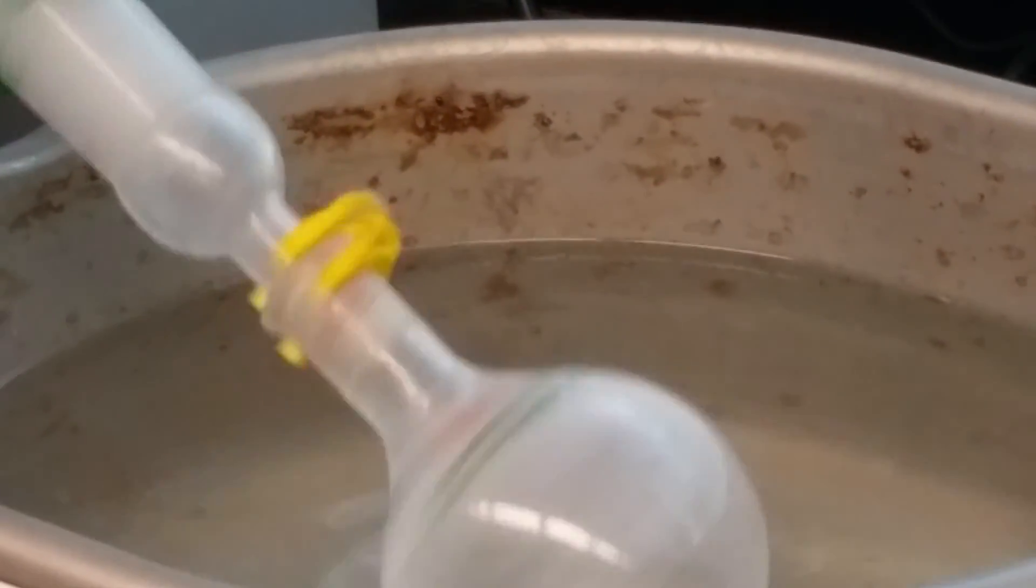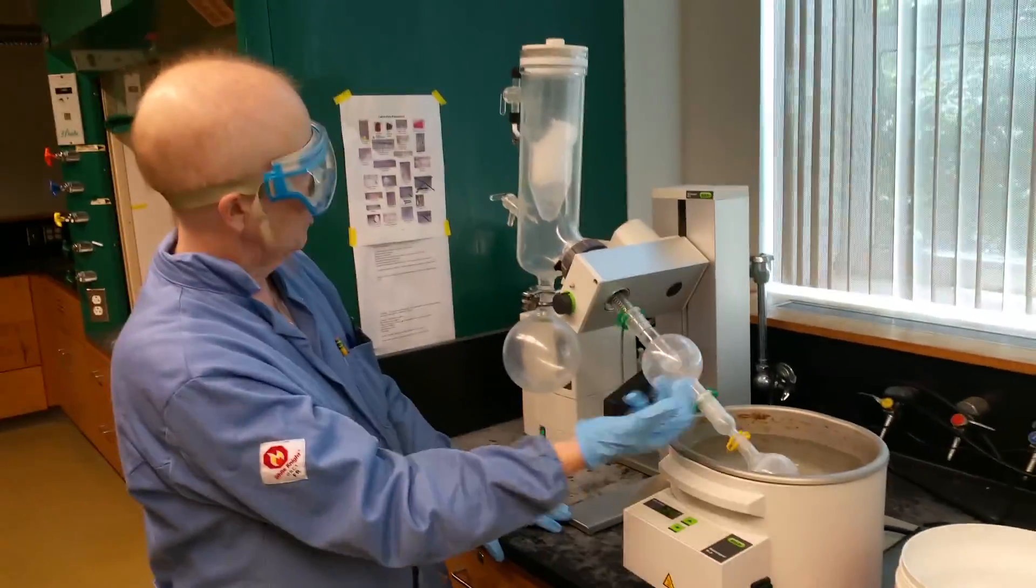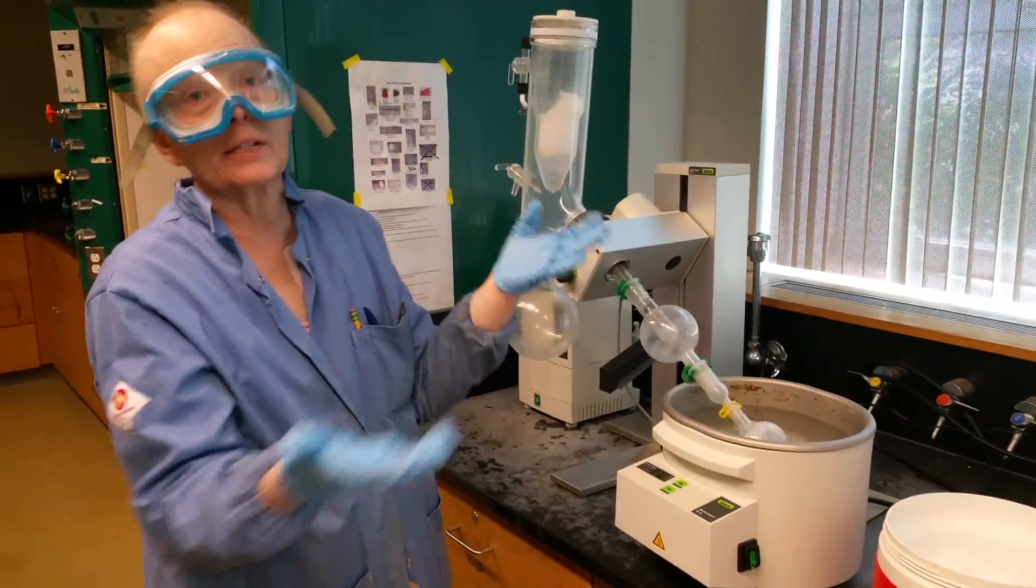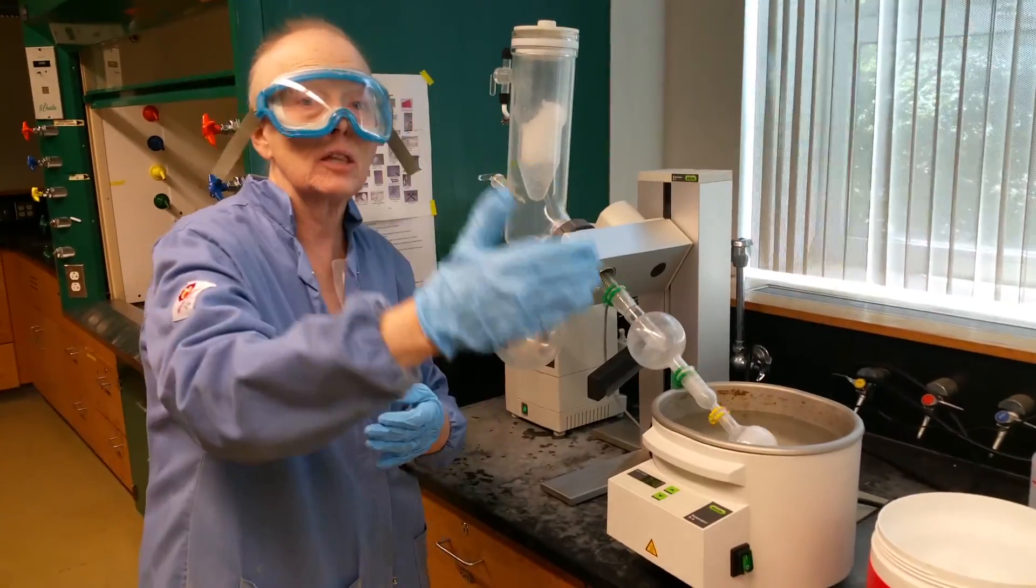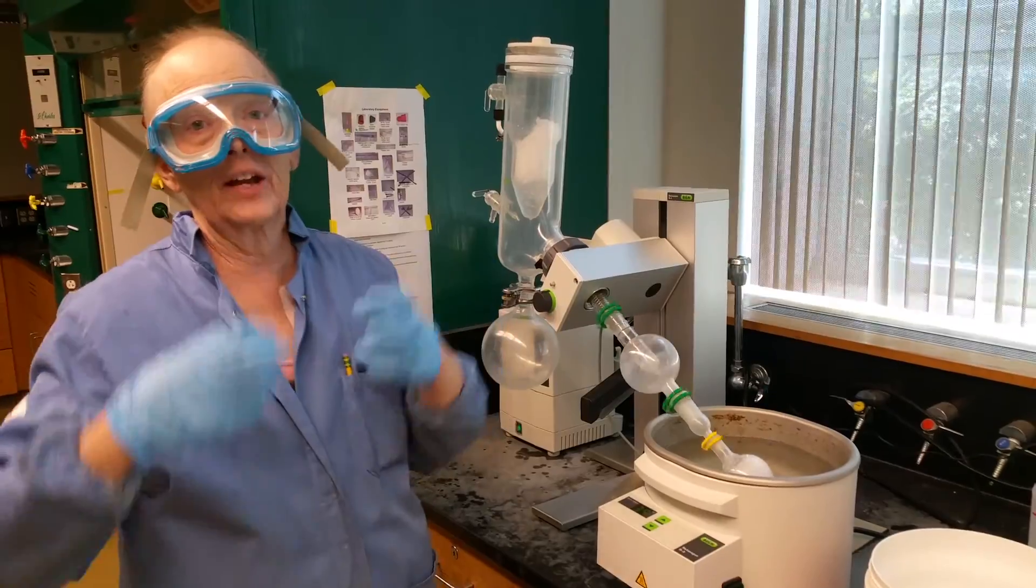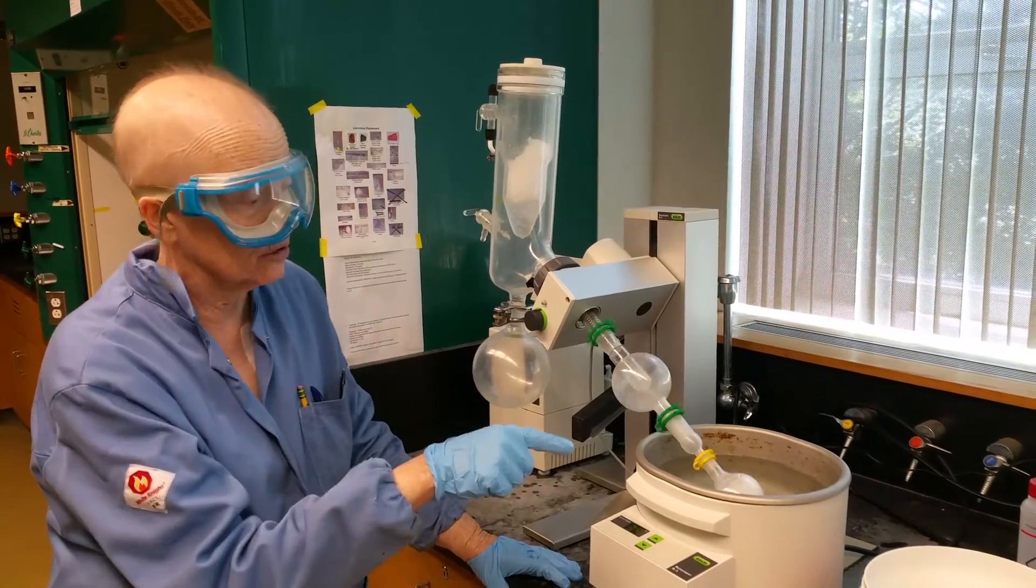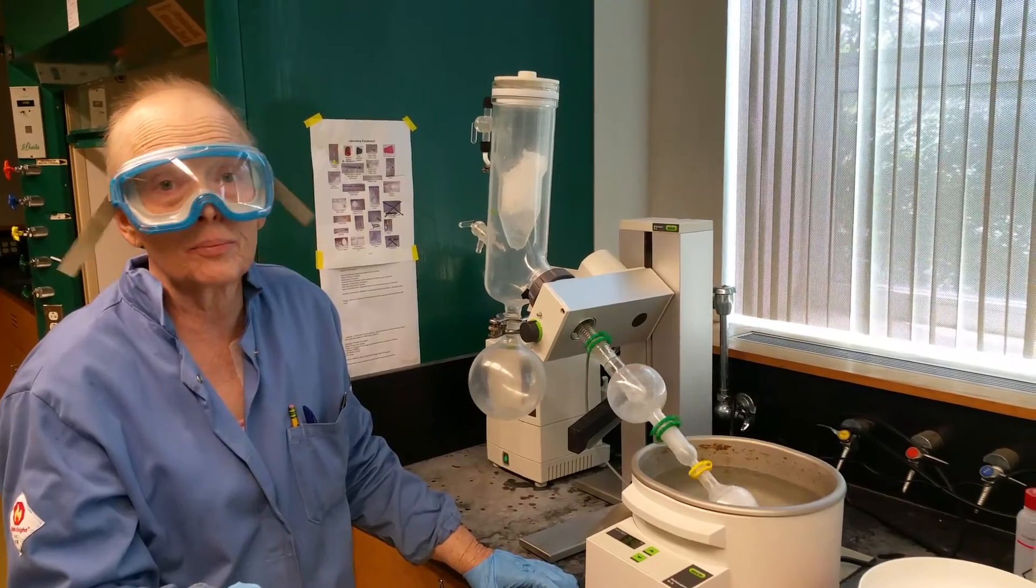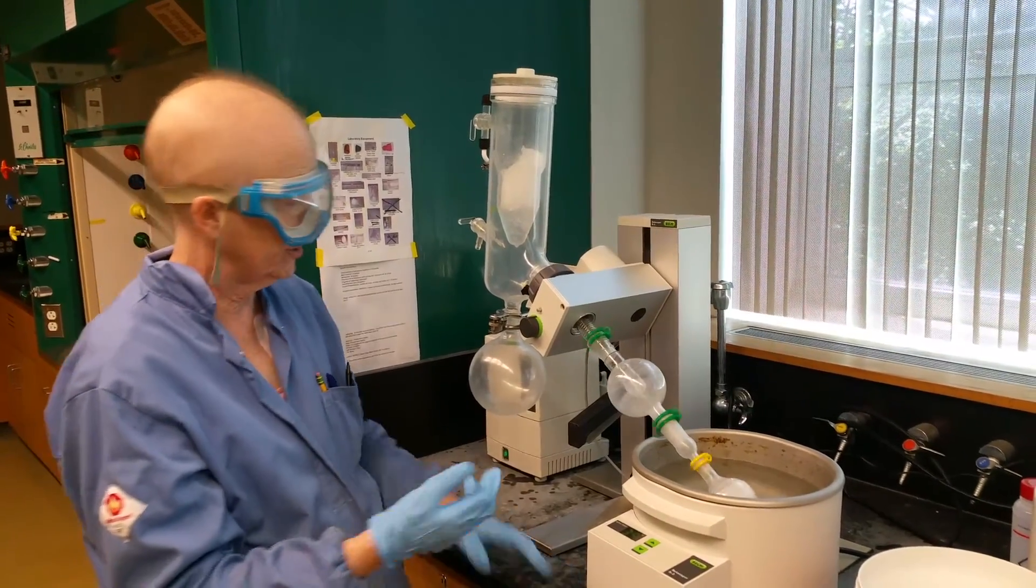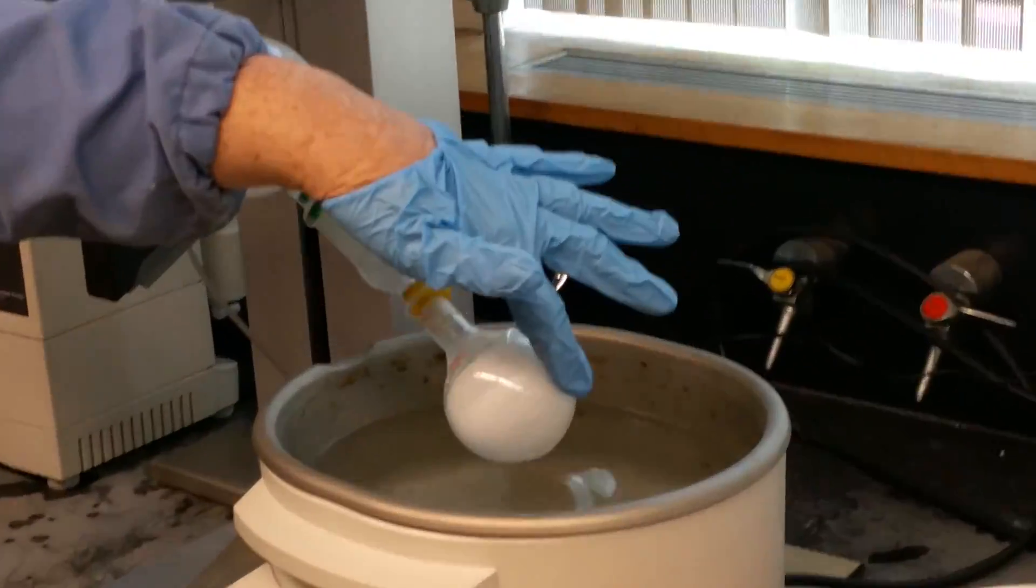All the vapor is leaving. The solid is staying behind. This would not work for two liquids that had close boiling points. If you had two liquids like cyclohexane and toluene, they would both vaporize and distill over. And notice you have no thermometer to keep track of what's coming off. So this only works when you have something that's very low boiling with something that's a solid or very high boiling liquid.